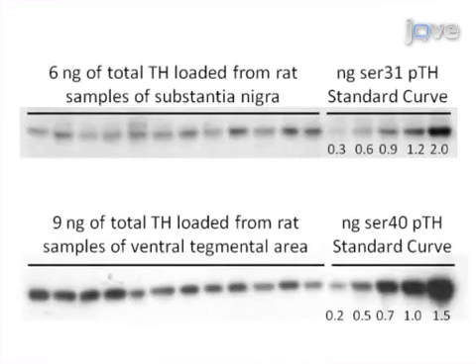Ultimately, the analyses of dopamine and its regulating proteins in the discrete midbrain somatodendritic regions enable conclusions to be drawn regarding the molecular mechanisms associated with dopamine regulation.